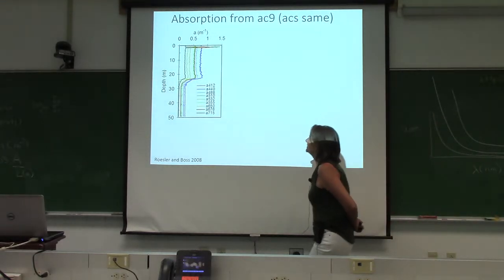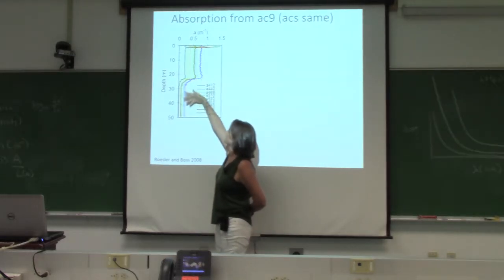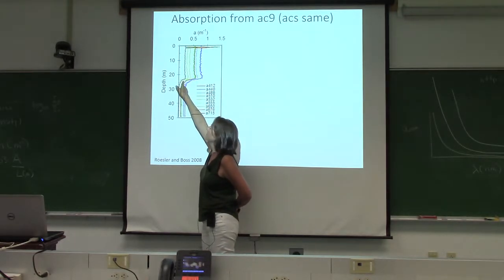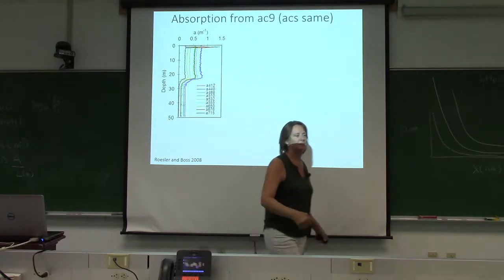So often you'll see some profiles presented. This is from an AC meter where it's a function of depth, and you see, oh, it's beautiful. Look, I've got a mixed layer. I've got probably a thermocline or pycnocline here, and then the deep water's clear. Awesome, I'm ready to publish.